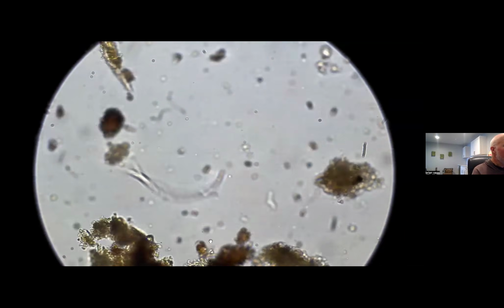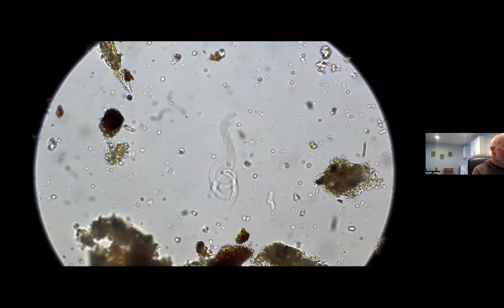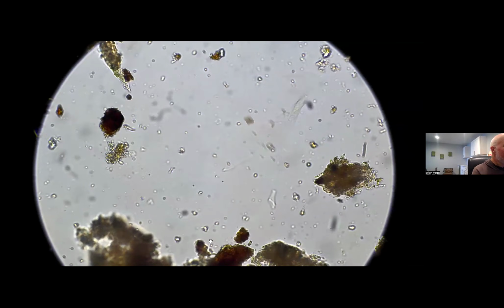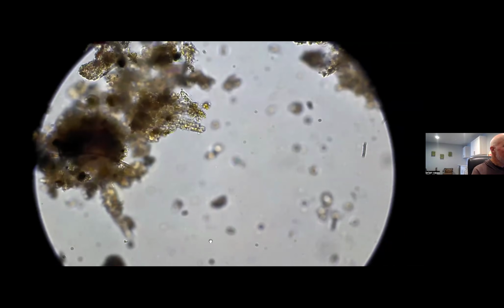Yeah, Brian, your soil's looking excellent. That test amoeba was beautiful. This aggregation, look at all your humics. Super proud of you being on the coast. That's impressive.